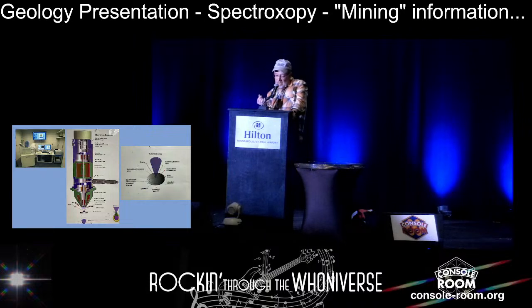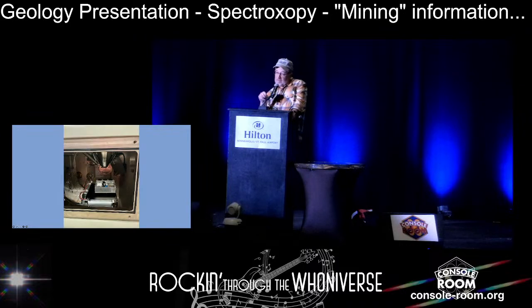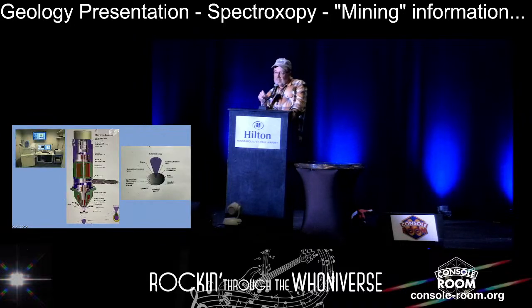Those electrons get focused down the column. Since they're electrons, we can't use lenses, but in this case magnets. We're going to raster the beam across the sample. So it goes through a few different focusing magnets. It goes through an objective lens aperture, which is a little 30 micron hole in a piece of molybdenum. And then we raster the beam over the sample. And then all hell breaks loose. All of these different things are happening at once. And we get visible light.